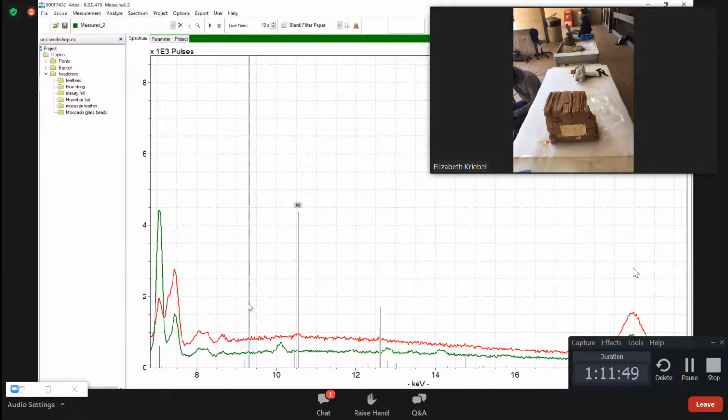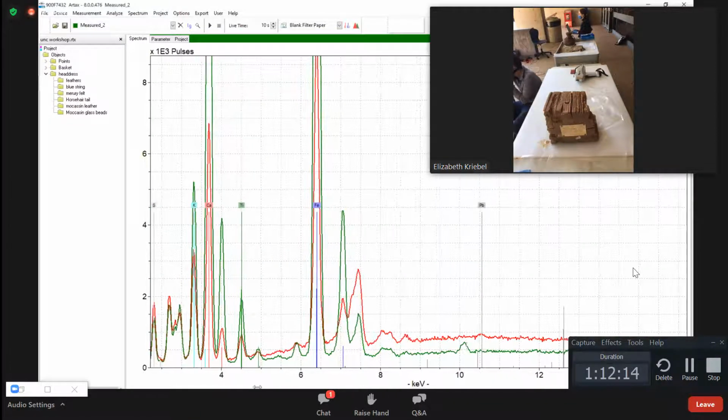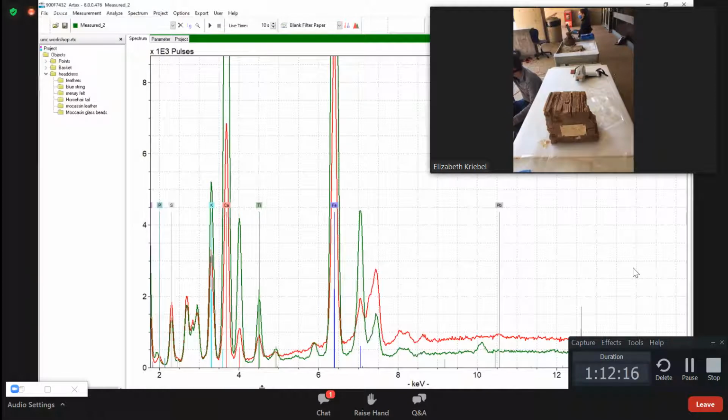So we've got a lot of iron, so that's the hematite. We've got titanium. My guess is that titanium is a trace in whatever deposit the thing came from. I don't think it's indicating any kind of treatment. I thought I might be able to see mercury, but no, it's not mercury. Glad you ironed that out for us. Yeah, but I'm bummed. So no, hematite pigment.